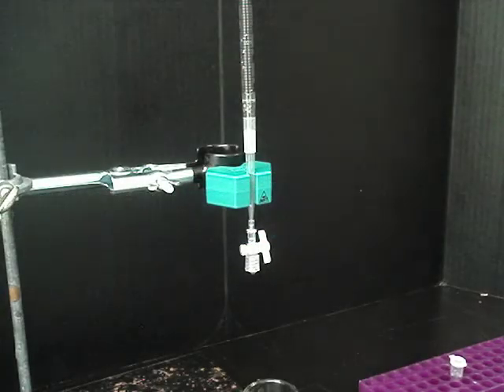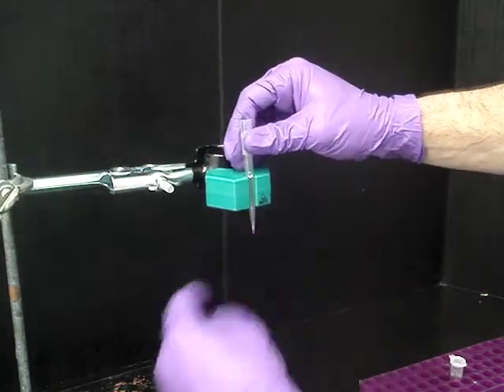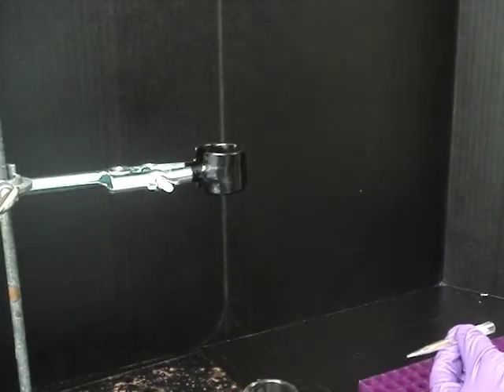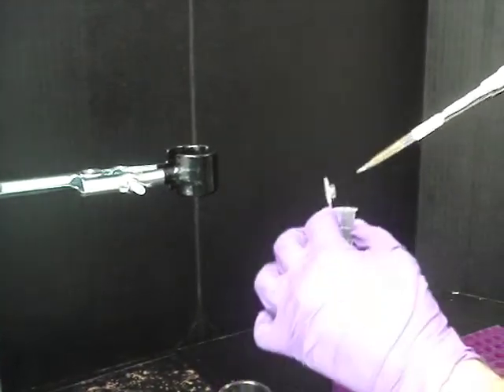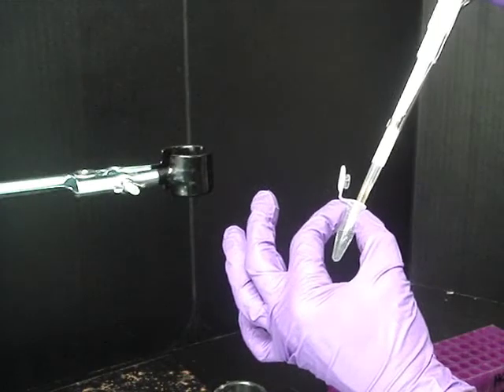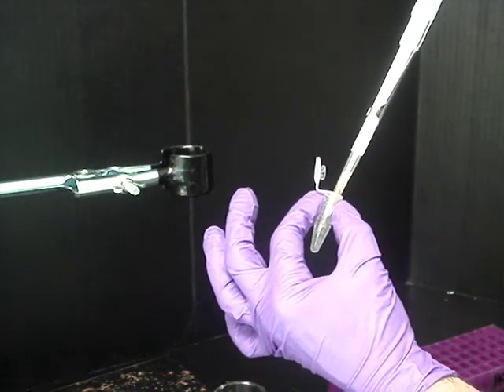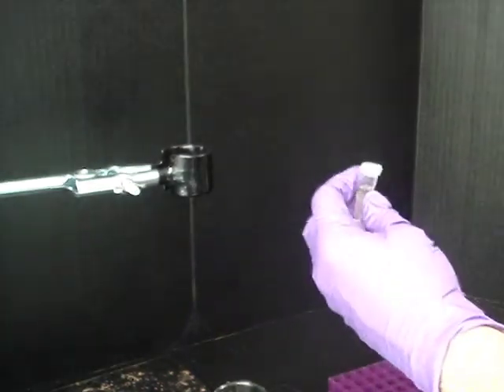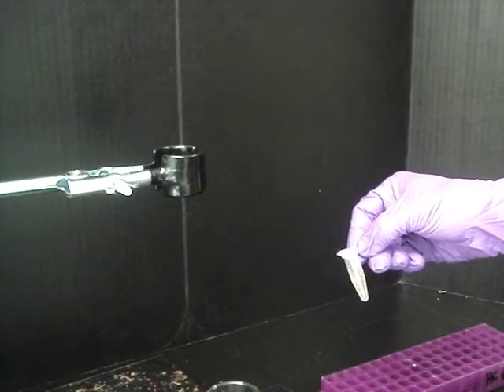Once the column is completely drained, we can then dismantle it in order to elute the bead-bound nuclei from the wall of the pipette tip. We do this by simply inserting the pipette tip onto a 1 ml pipette and using it to draw in and out a fresh solution of nuclei purification buffer. In this way, we get the beads off the wall of the tip and into solution again. And now we have a pure population of nuclei from our cell type of interest.